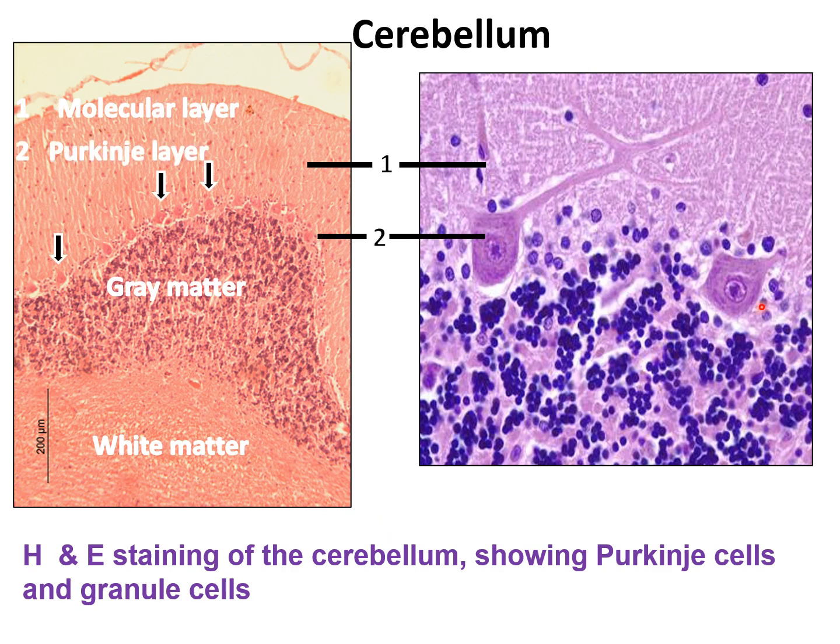This is showing the Purkinje cells. These arrows indicate the Purkinje cells, and this thick layer is the granule cell layer. In higher magnification, one can see the Purkinje cells, the central nucleus, the dendrites of the Purkinje neurons, and the nuclei of the granule cells.